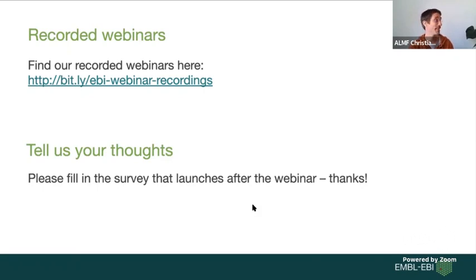That's a very interesting question. So I would recommend to watch the NEUBIAS Academy talk about this. It's from Fabrice Cordelieres. He is the author of actually one of the co-localization plugins in Fiji. I think it's called JACoP. And he also wrote 2 papers about this topic. So I would definitely check them out. And actually, it's interesting if you listen to his talk, his recommendation in the end is you should probably write code for your own method of co-localization. Yeah, and he's the author of the plugin. So, and I agree with him.